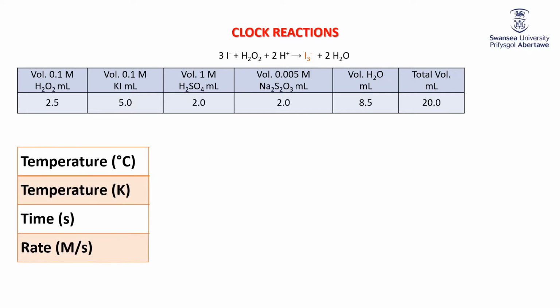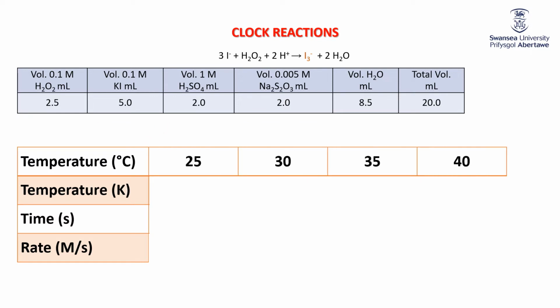So you each had your own water bath, you popped in the same concentrations, so we're keeping those the same now, but we're changing the temperature. Those water baths were set at 25, 30, 35, and 40. And when I did it, these were the data that I got.